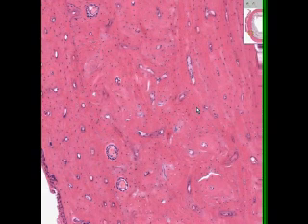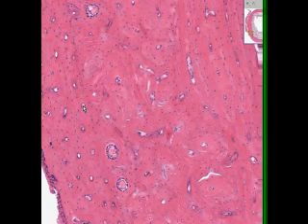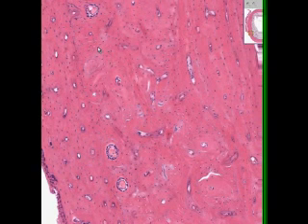The dense cortical bone itself has these little circular spaces which are called haversian canals because they form the units of bone formation, or the haversian units, in which you have the central holes delivering nutrients filled with blood vessels, and then growing around them in a concentric and lamellar fashion are your osteocytes.